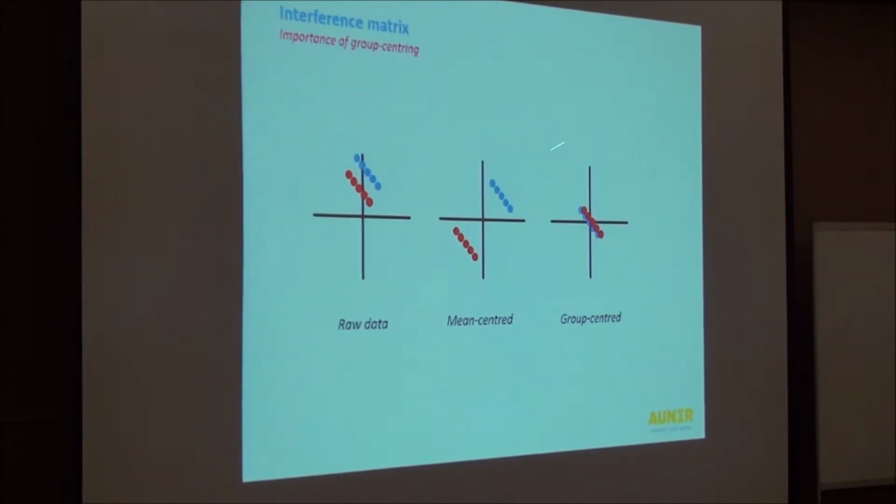We don't want to downweight this direction, which is related to what we are interested in, the identity of the sample or concentration of the sample. We want to downweight what makes the identical samples different. We ask why they're different. We want to get rid of that. That direction is undesired. We want to shrink that direction or remove it completely. Some methods try to remove those directions completely. There are hard orthogonalization methods, and some of the methods try to shrink it, like the method that I use. So you will have more control over the level of shrinkage.